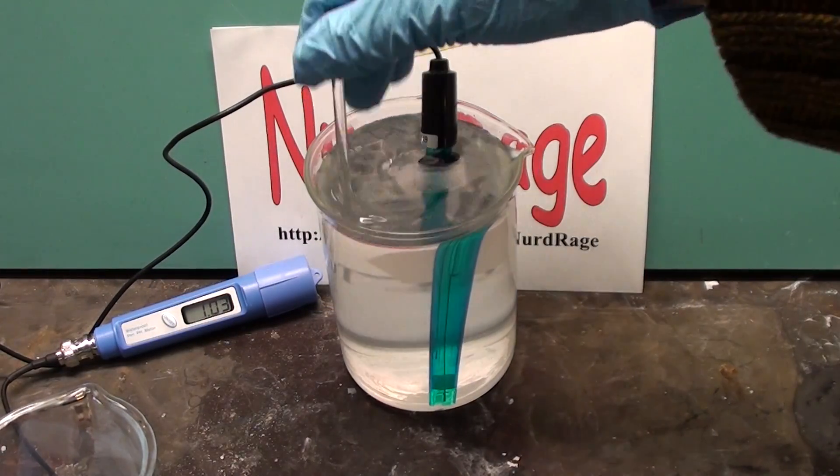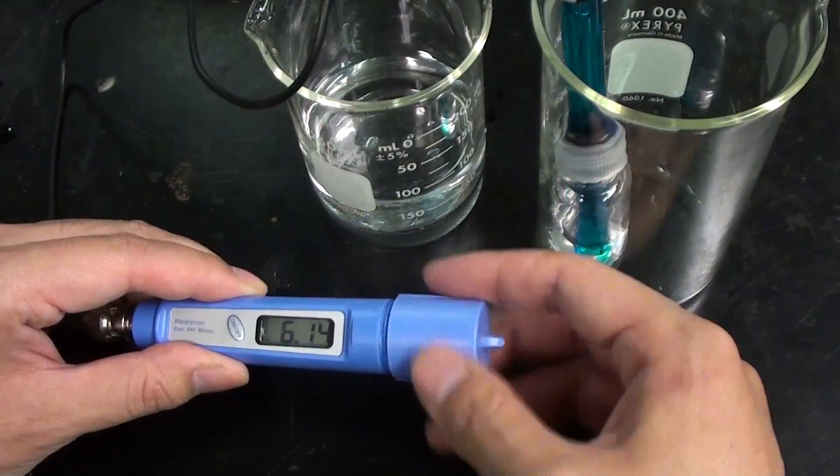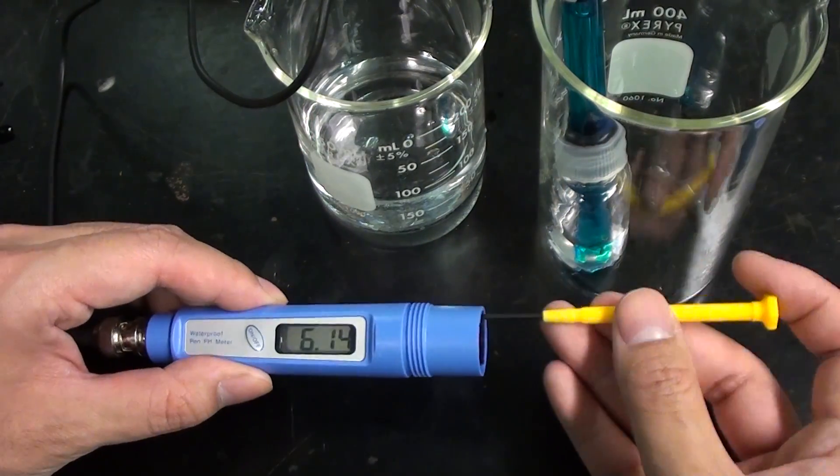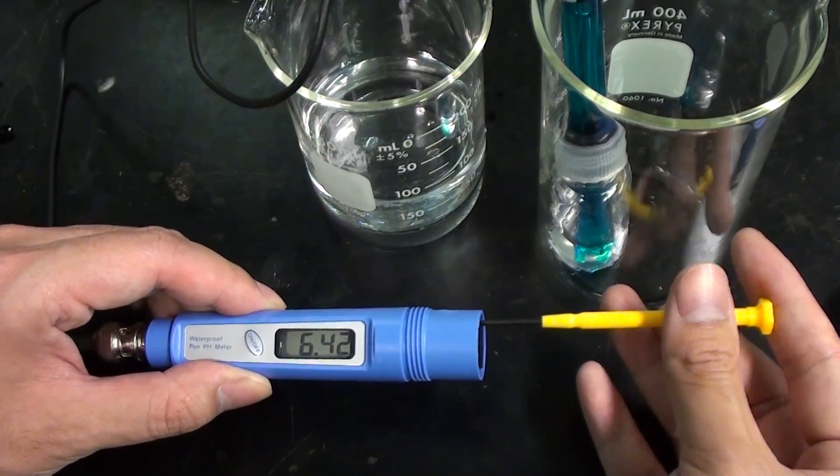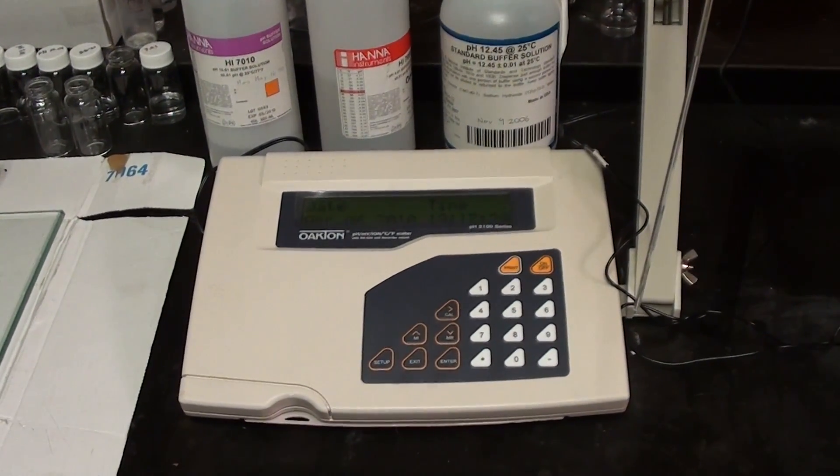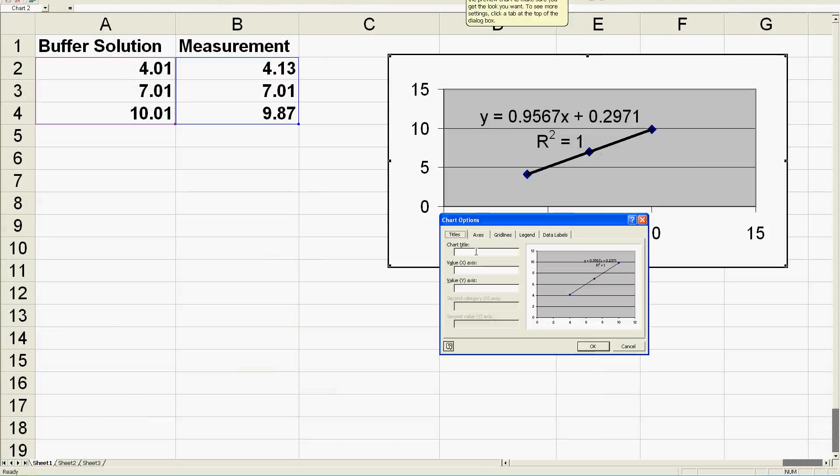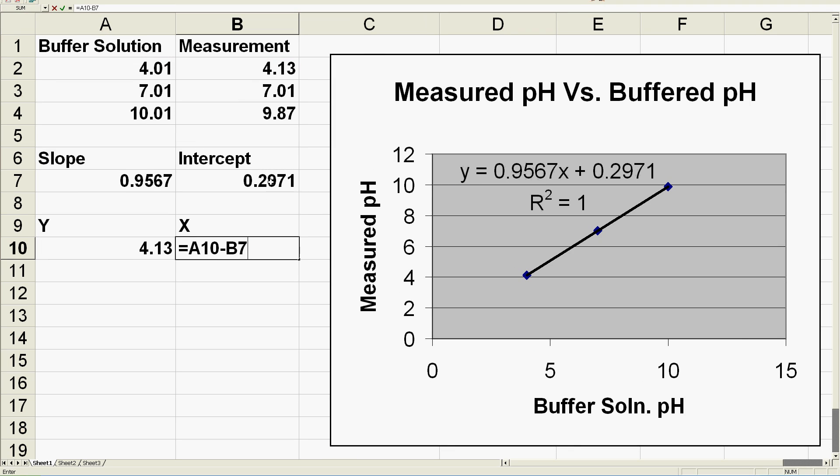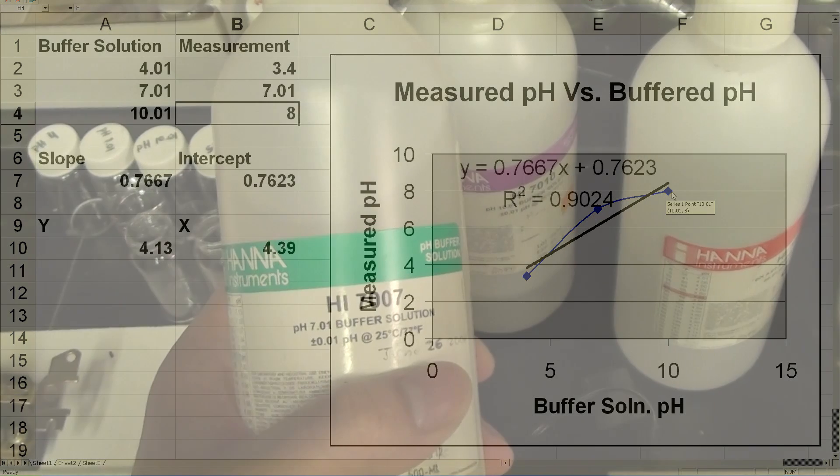For a lot of reactions this tiny error isn't an issue, and calibrating to the point closest to the expected pH of your reaction is usually enough. On a more advanced instrument, the onboard computer would automatically compensate. But to save money, we're just going to use your personal computer along with a spreadsheet and some math.